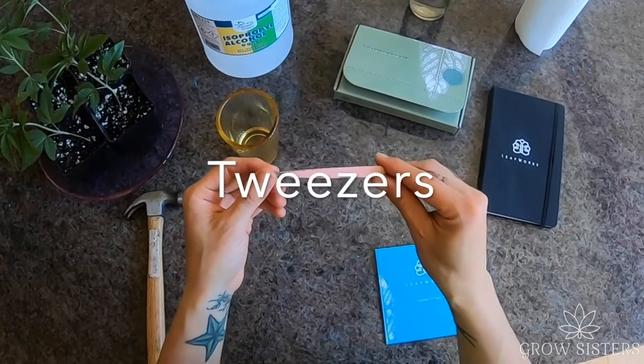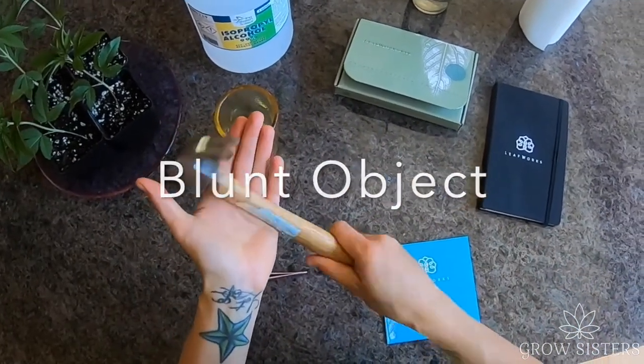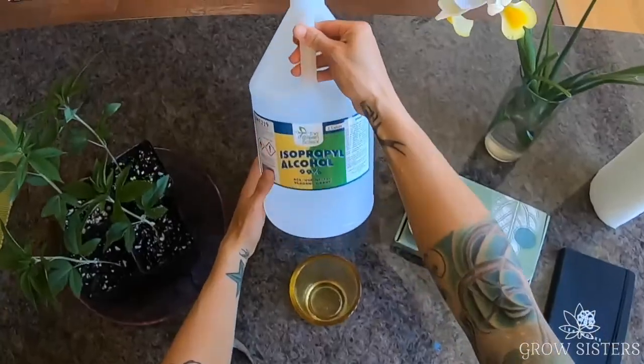Here are the things you will need: tweezers, a blunt object, a glass or beaker, paper towels, and alcohol.